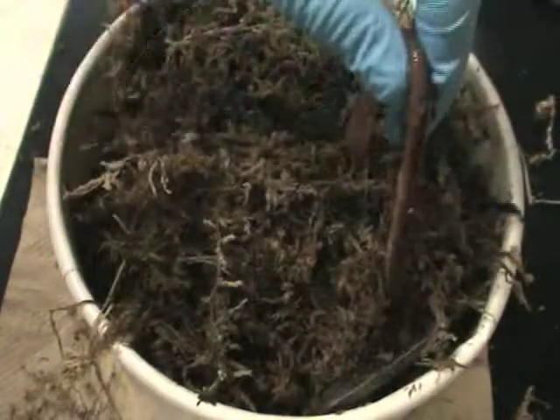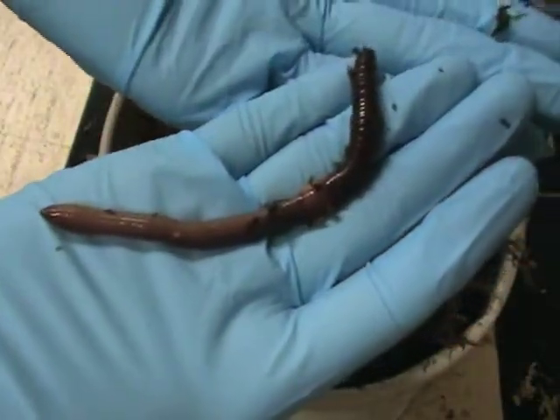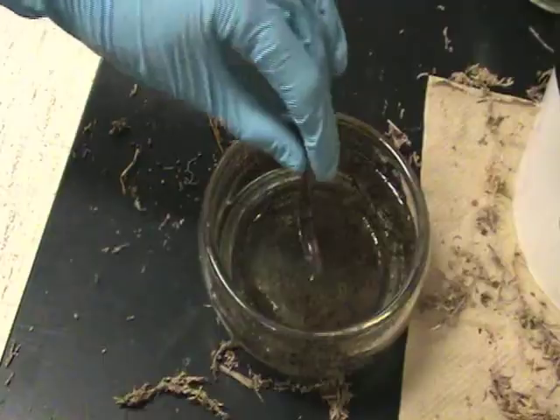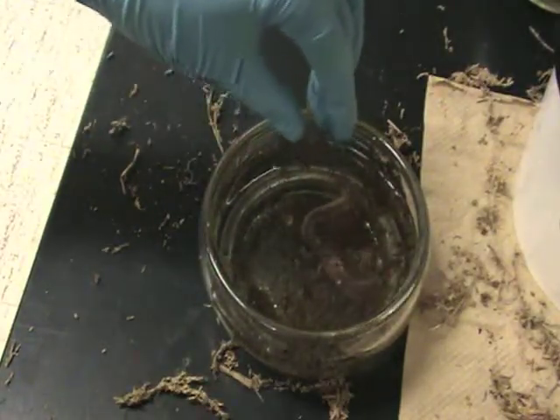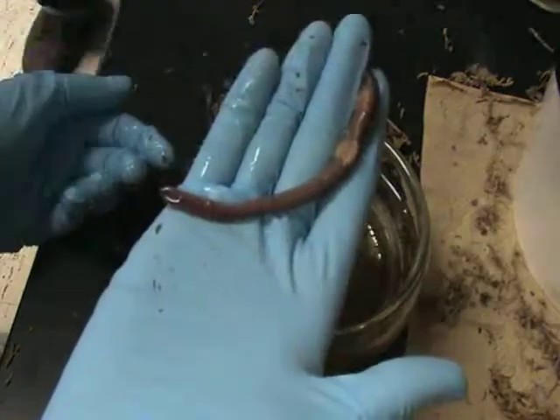Begin your dissection by picking an earthworm out of the dirt and observing its external features. Then, dip it into the sleep solution, which is actually rubbing alcohol. Retrieve the worm after it has quit moving.